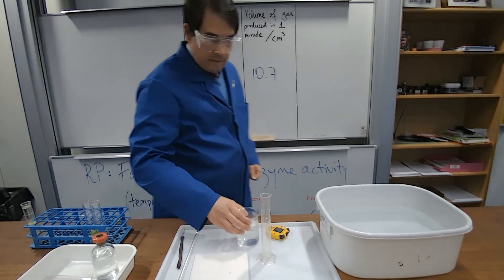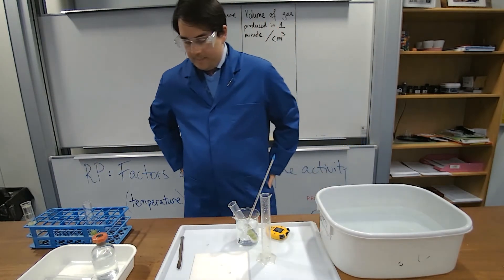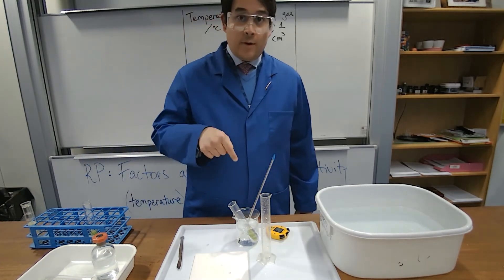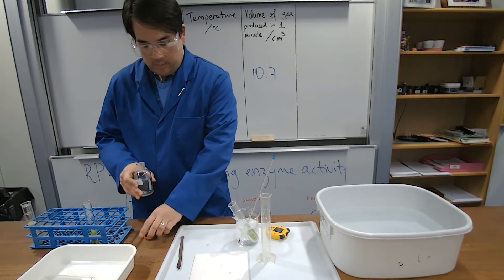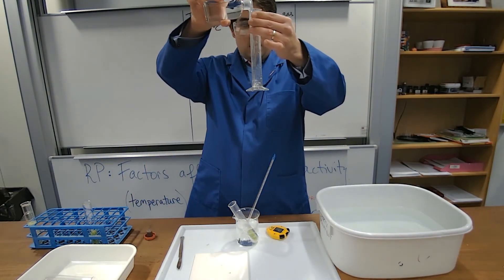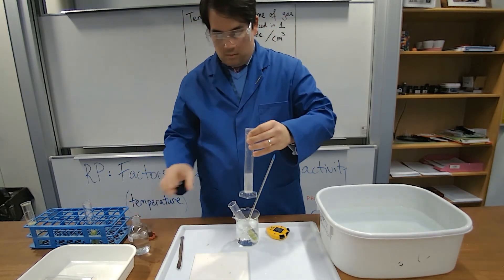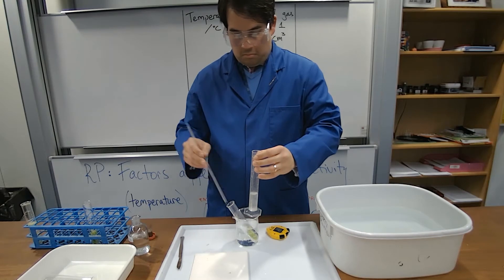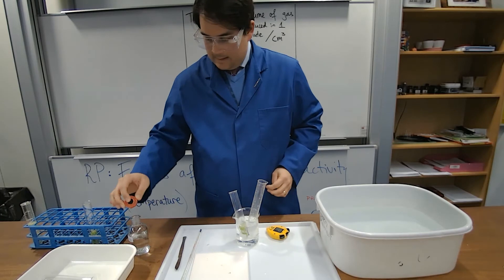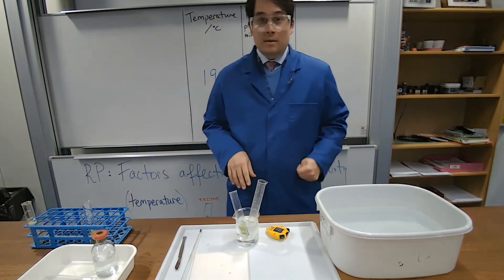So, now I've got a water bath and hot water. I'm going to put the thermometer in, then allow the celery to acclimatize. I'm also going to put some hydrogen peroxide in, so it's also roughly of the same temperature. Didn't really think this through. Look at that! Okay. Just going to leave that a few minutes to settle. Right back.